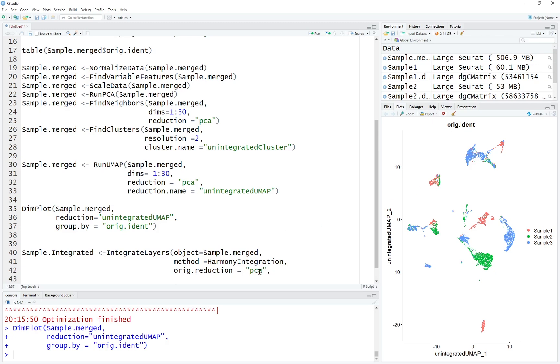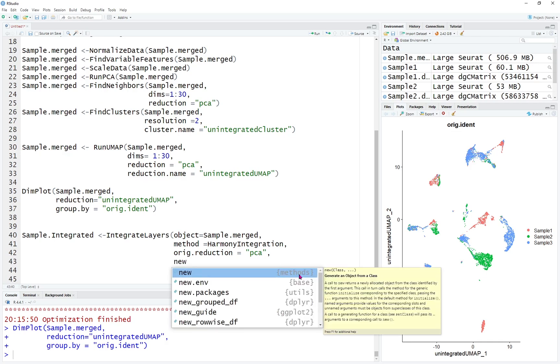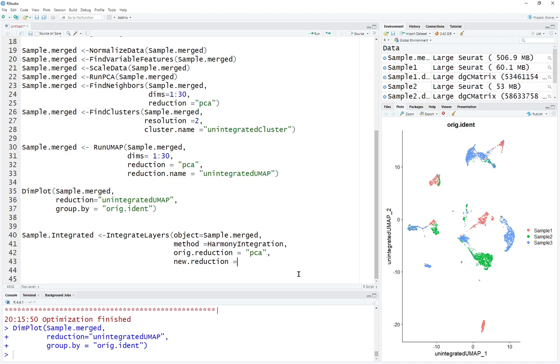We're going to use the original reduction equals PCA — principal component analysis. The new reduction we're going to give a new name: harmony. You can name it to other things, but I recommend using the default name, just harmony. The verbose option, which shows the process, we can set to TRUE so you can see the process in real time.